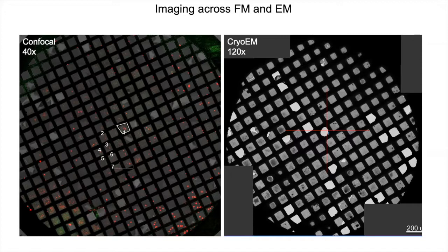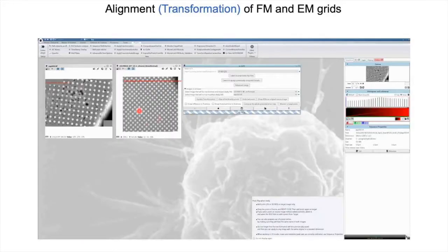So now you go into this square. You can actually do all of these automatically on eC-CLEM, which unfortunately I did not give you the data set for. So you can go on these on eC-CLEM, and now you can look at the high resolution image alone. So here you have a high res image of the beads and the virus on cryo-EM. They will appear something like this. You have dark spots and big blobs over here, and this is your fluorescence image, okay?